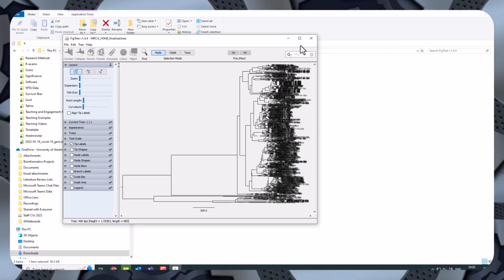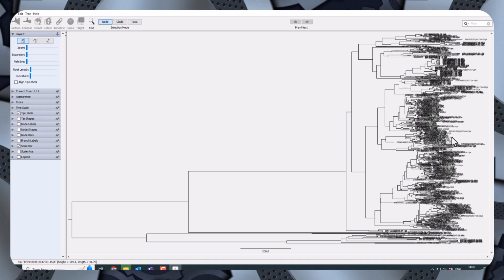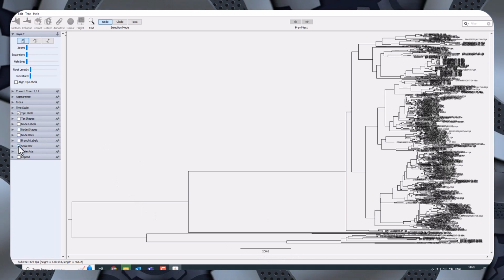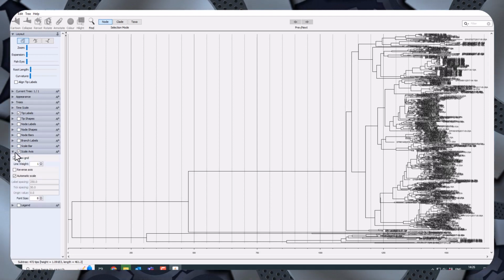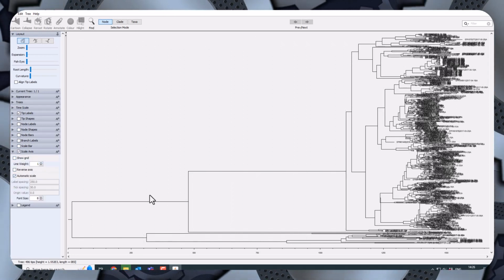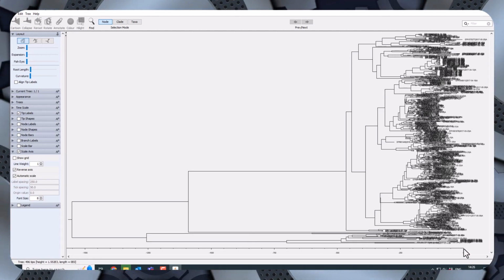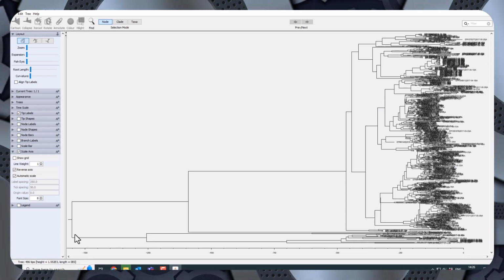sequence that's been collected, and you can read off the most recent common ancestor because it's this vertical line here. So this is the split between the ancestor and when it's split into two groups. So the most recent common ancestor of this group and this group occurs here, in this time point here, which is minus 1,500 and something years ago. Days ago, sorry, not years. This is a bit difficult to look at.